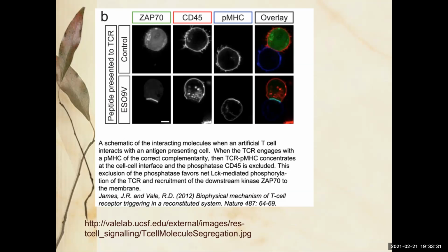Okay, so in fluorescence microscopy, the way it works is that you hit your specimen with high intensity light of a certain color. It absorbs that light and then it gives it back to you, but as a different color. And we will cover this in great depth after this module. We're going to go into fluorescence for a few weeks, but that's the gist of it.